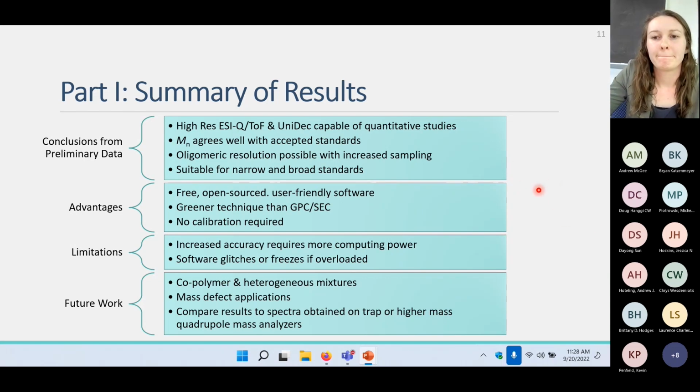But I know Brian Katzenmeyer's on the line right now. I'd be interested in seeing if he'd be willing to work with you. He's got a MALDI MRT, but I believe he also has electrospray capabilities on there. So now you can really extend that mass range out, and you probably get really nice high resolution. Yeah, I was actually interested in reaching out.